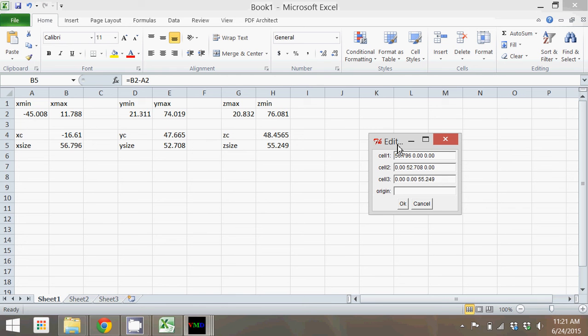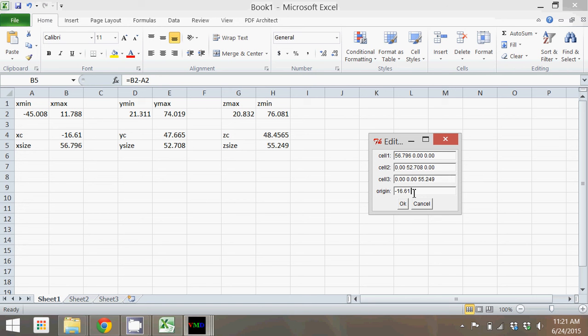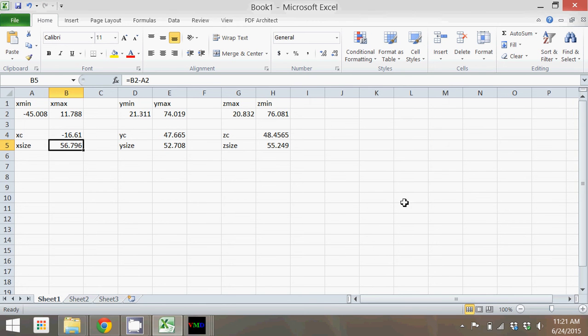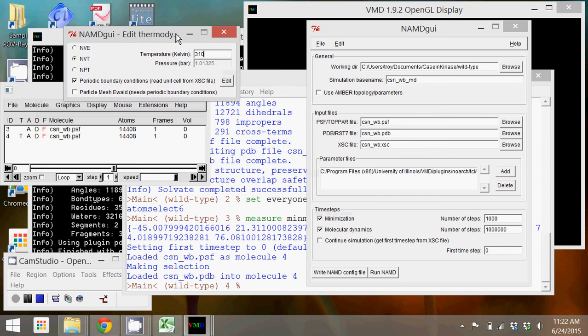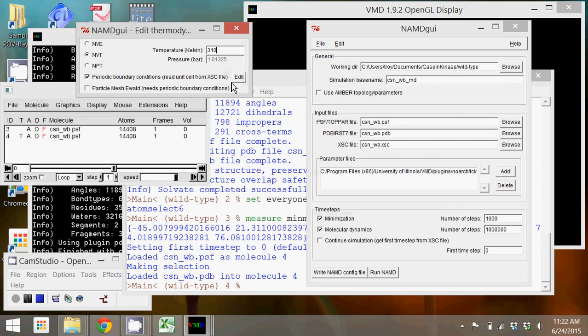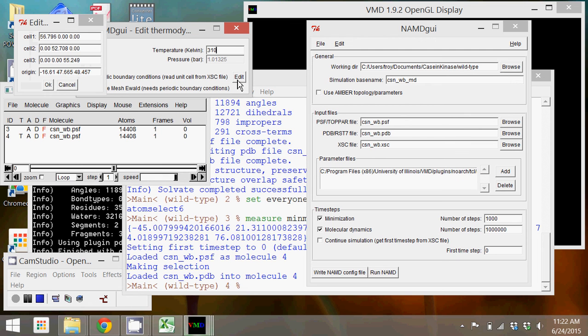These are just separated by a space, so there's no need to do anything other than put a space in between the numbers. For the origin, those are the centers that we calculated, so it will be minus 16.61 space 47.665 space 48.457. Then we can click OK. Once we've clicked OK, those should now be saved.